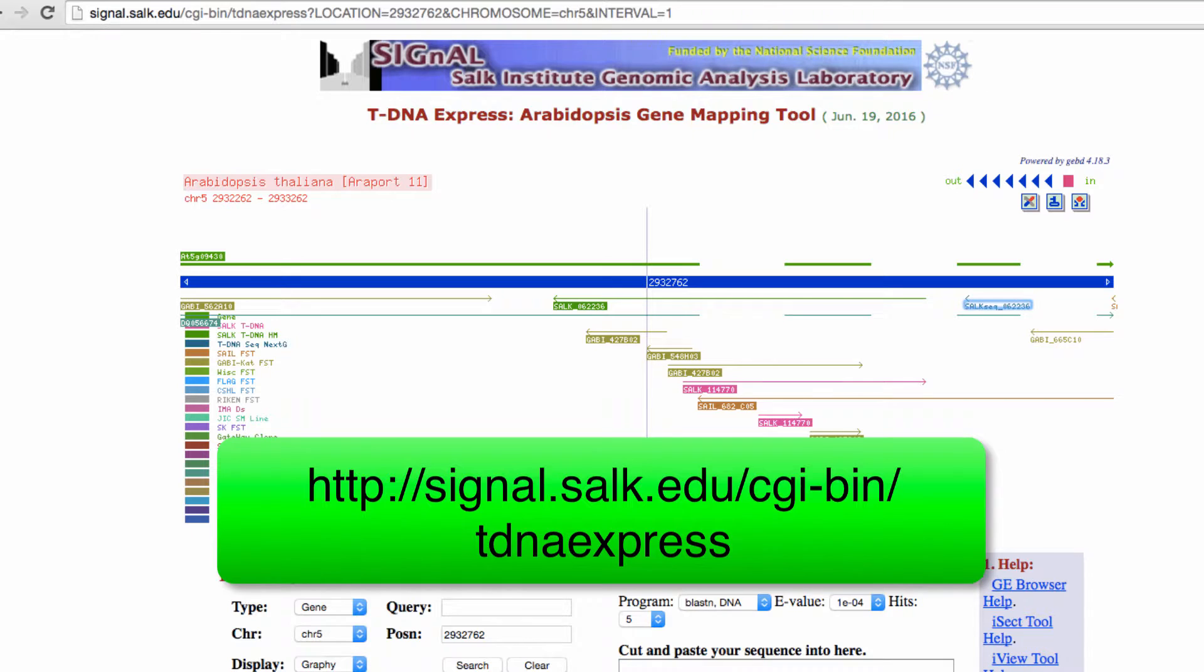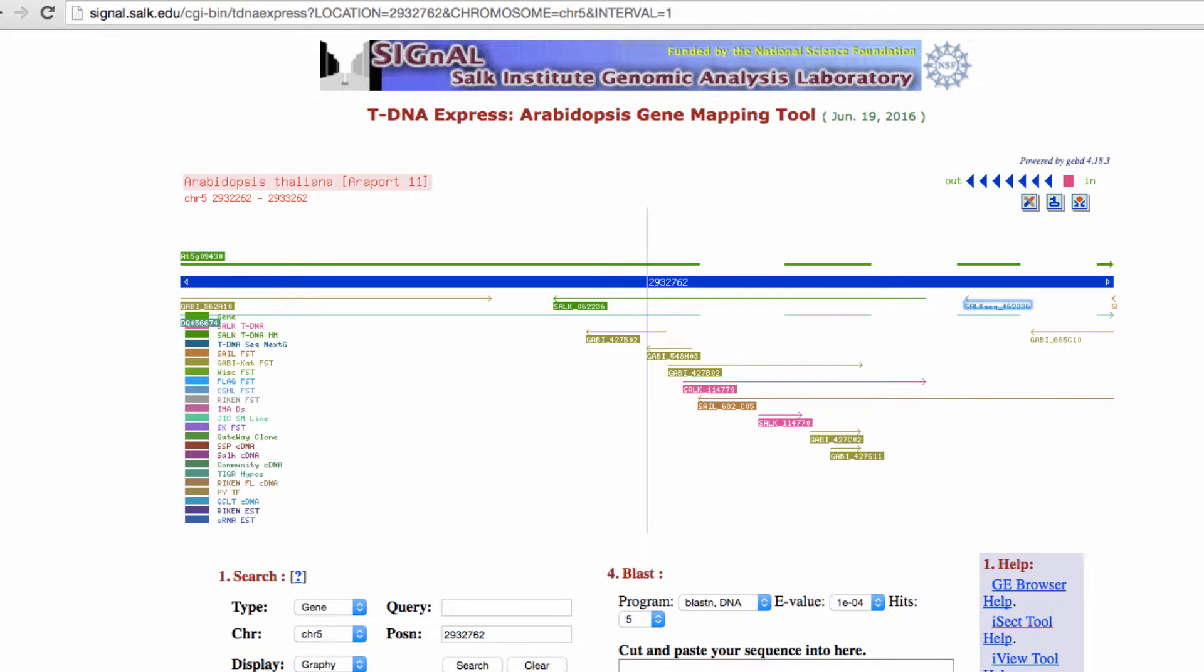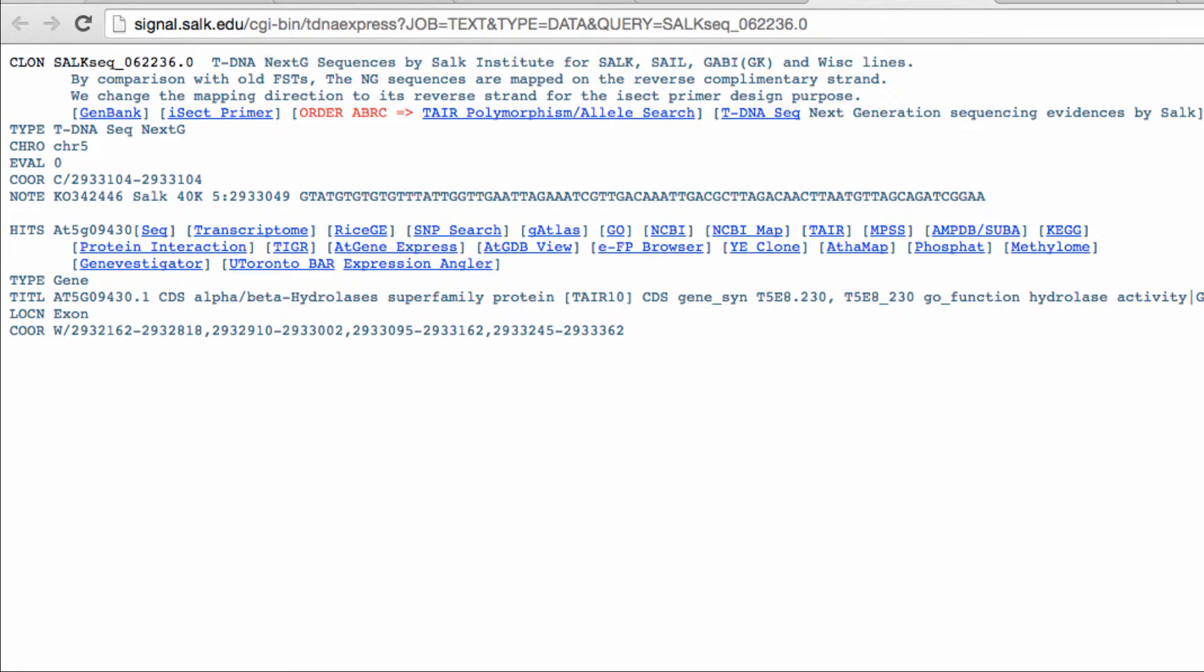A more comprehensive mapping of tDNA insertions, including the newer tDNA-seq FSTs, can be found using the Salk tDNA express tool. Once you find an insertion of interest, you can click on the name and view the details, including the coordinates, flank sequence, and a brief annotation.